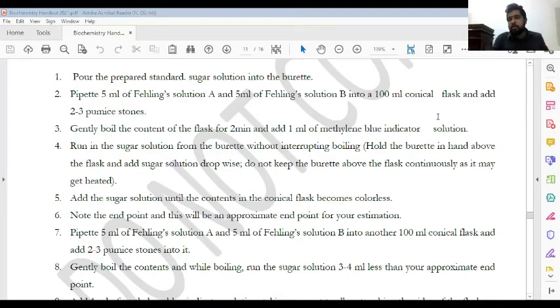you know that food is a complex matrix. We cannot have carbohydrates, proteins, moisture, lipids separately. It is a complex material. So we provide heated conditions to facilitate the release of bound sugar. When we are using a food sample, that helps to release bound sugar.